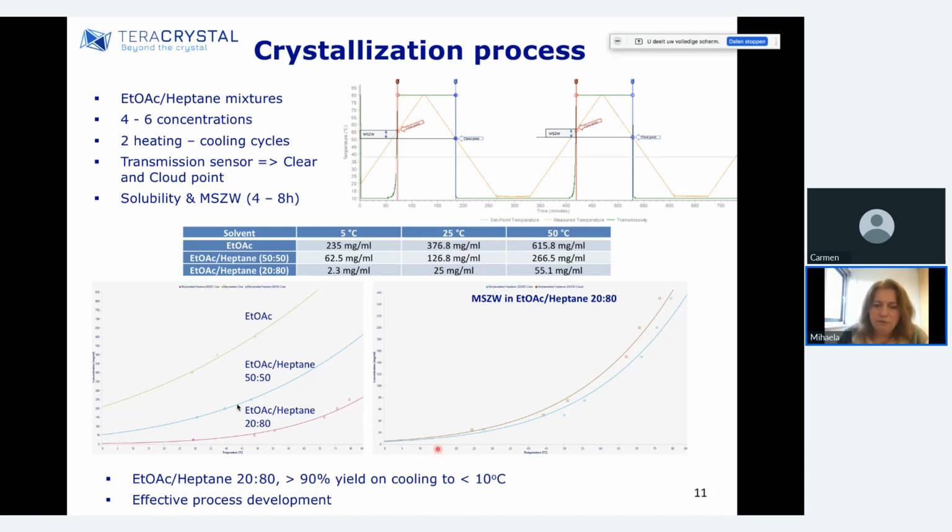And well, then looking at different ratios between solvent and anti-solvent, you can imagine that maybe a second step of optimization would be necessary if you want to be safe with respect to the width of the metastable zone and such that you can control, for instance, the particle size distribution. So by further optimization, you would definitely in this system be able to develop an effective crystallization process.